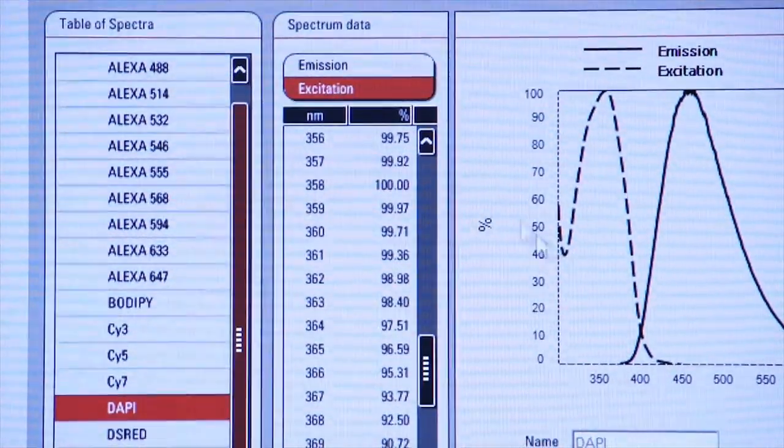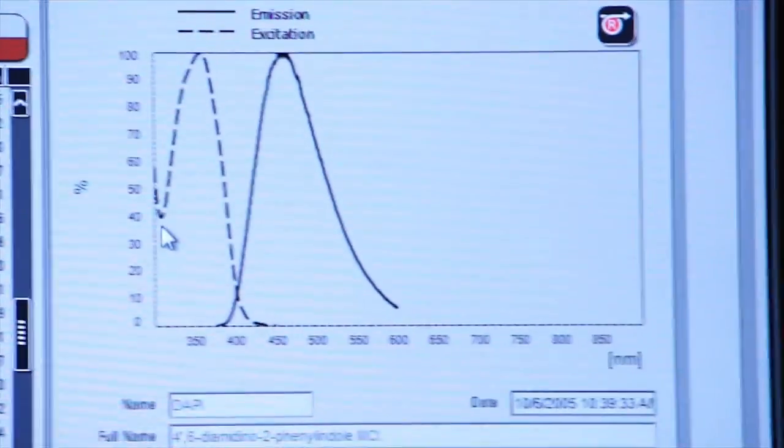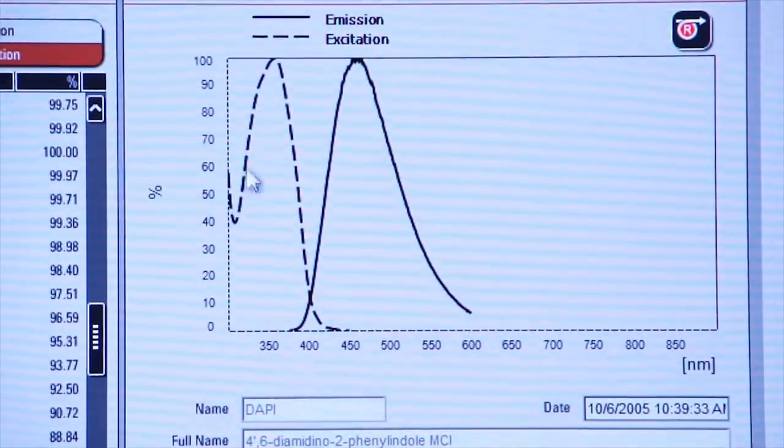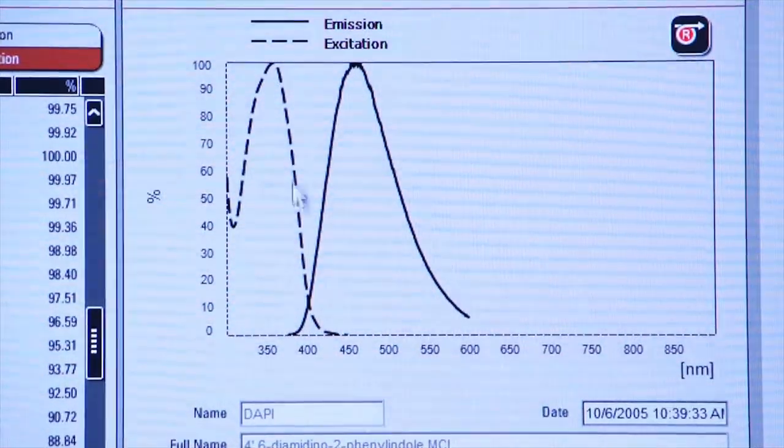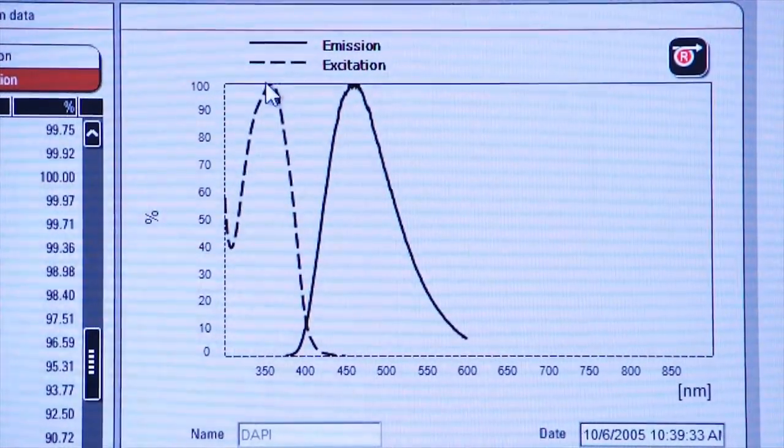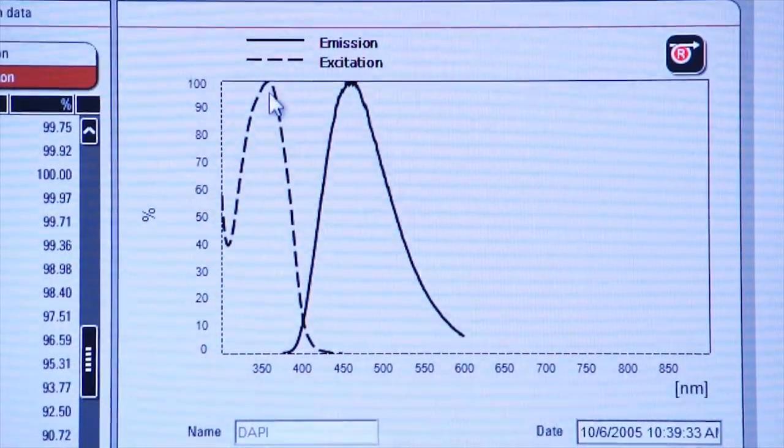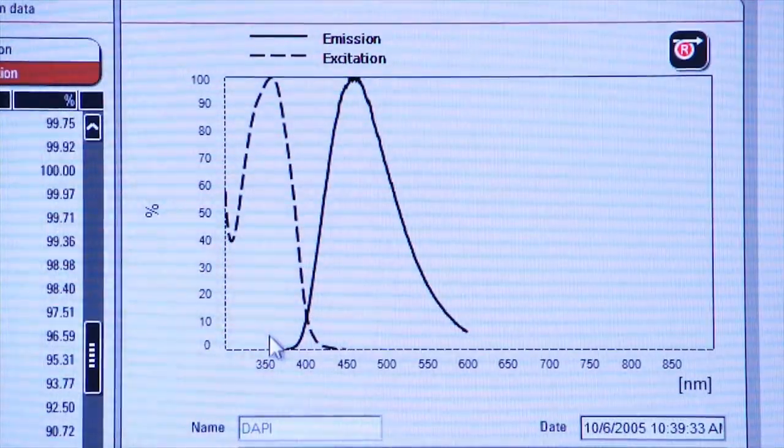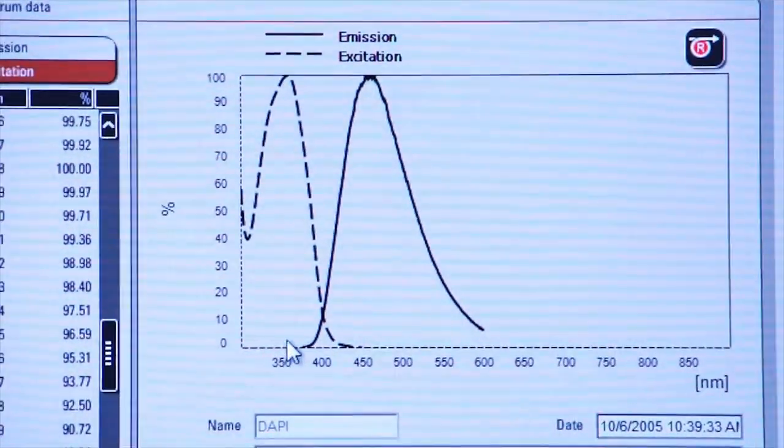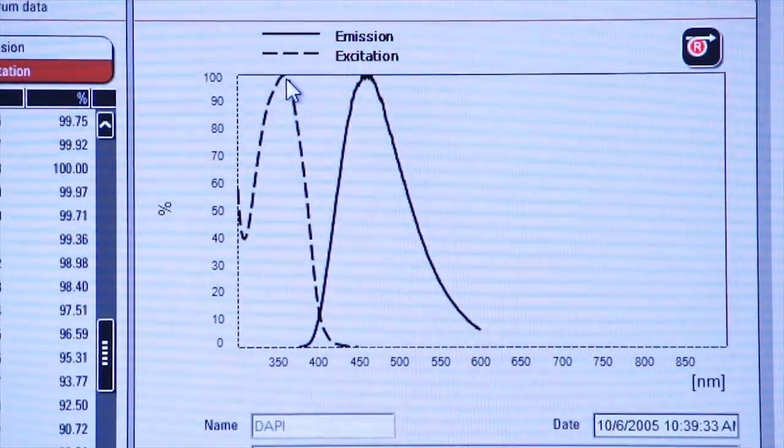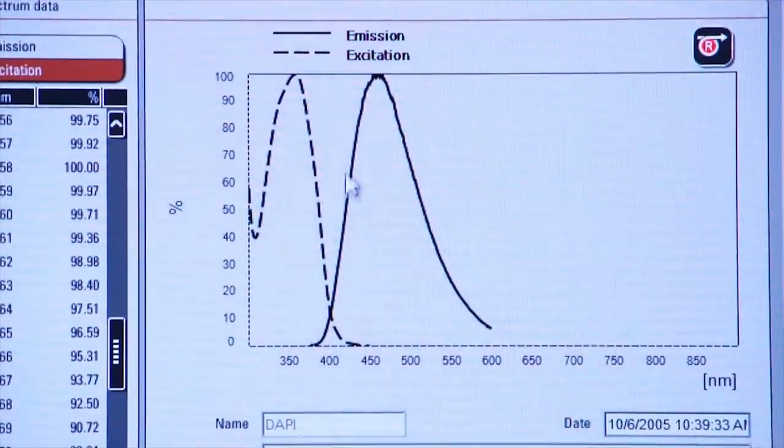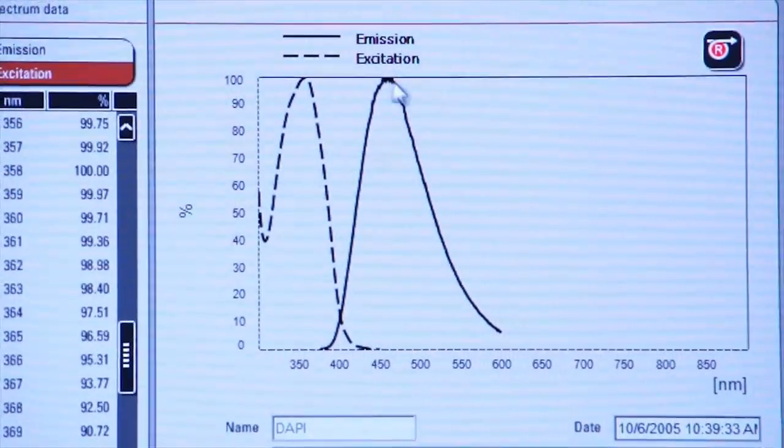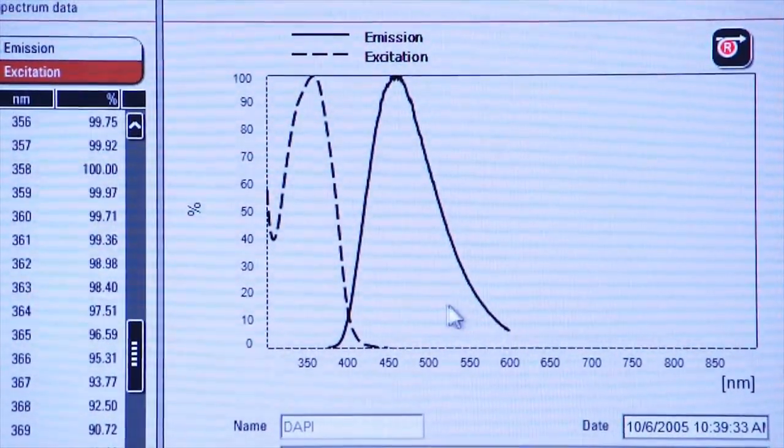To the right, I also have a graph which shows me the excitation curve. This is the amount of light that's required to excite this fluorophore at a given wavelength, and you can see the peak is right here. Then we have an emission curve, which is the amount of light that's generated by the fluorophore after it's excited.